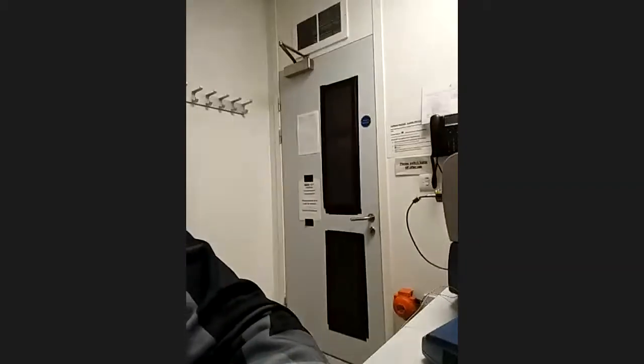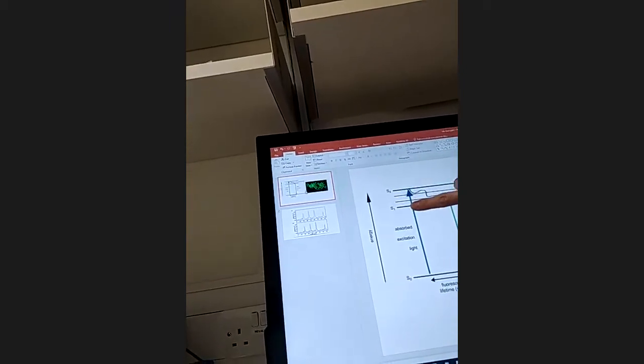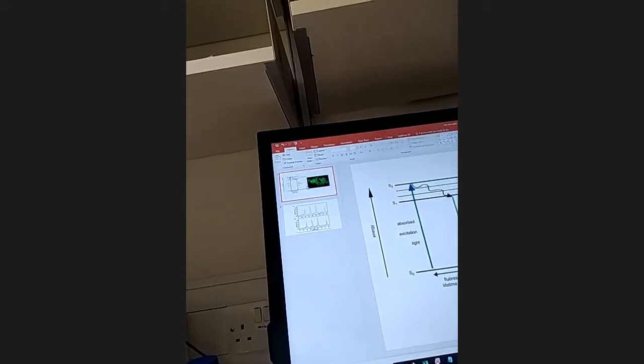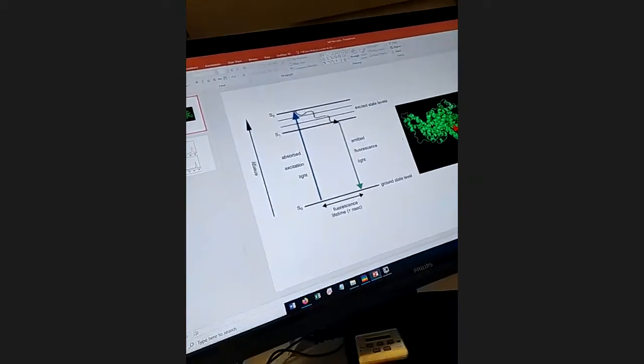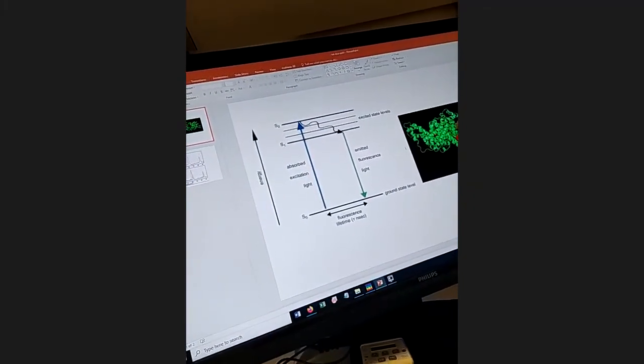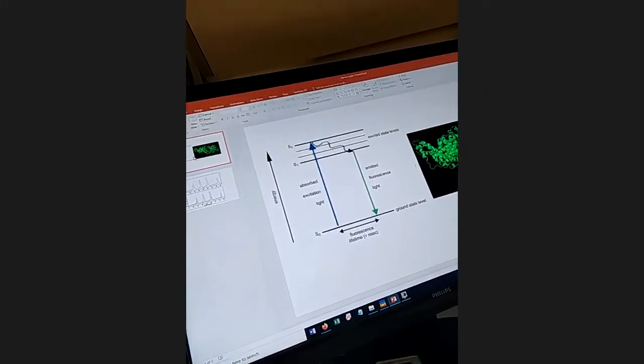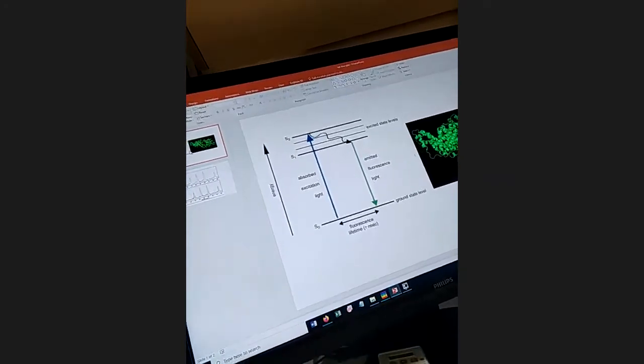You can't really tell, because if I bring up my diagram from before, the difference in how long this takes, to go from this excited state to a slightly less excited state so it can emit the photon, is dependent on vibrational changes. One of the things about protein structure is that it's very complicated. As it denatures, the thing will tend to be pulled apart. Will that mean that there's something vibrating close to this or further away? You can't really tell that. It's not as simple as it would increase or decrease.